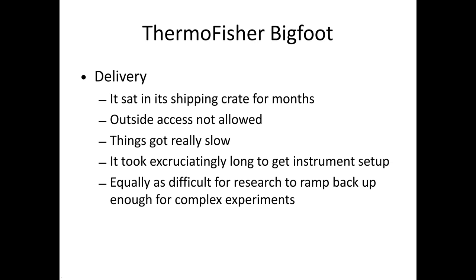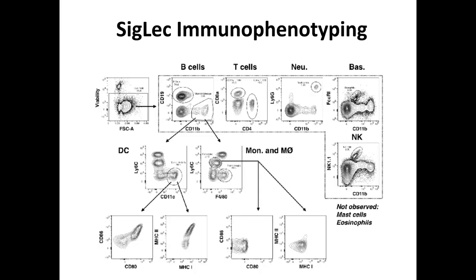And it was our buddy Landon Edgar, who's now at the University of Toronto, and he had a great model. He actually came from a mass cytometry background, doing high dimensional stuff and making all the reagents. And he came over to Scripps having done no flow, and he was just brilliant, picked up on it right away. And his model was looking at carbohydrates on different phenotypes. So it was a great model because you could use classic immunophenotyping combined with co-expression of these different carbohydrates, and it all correlated out really well in this high dimensional stuff.